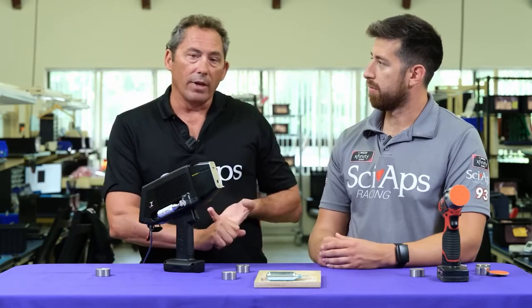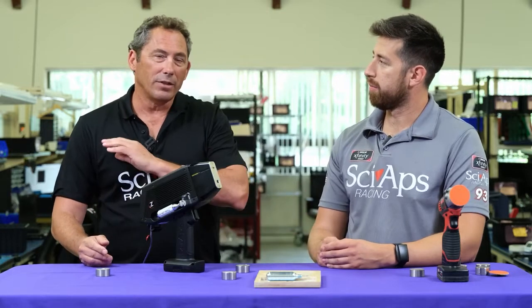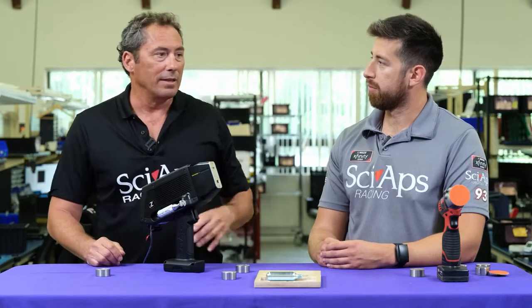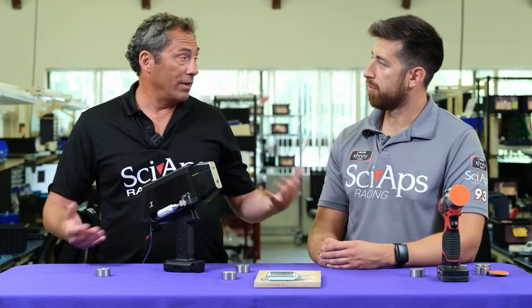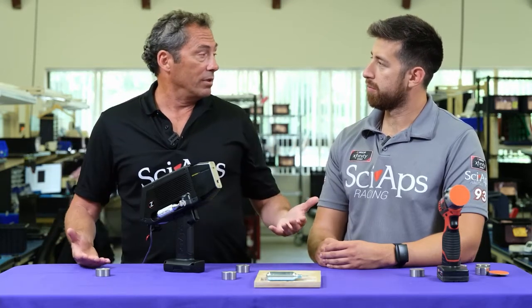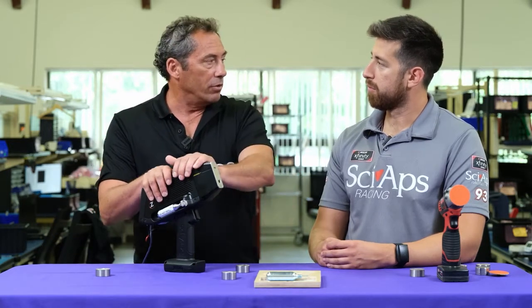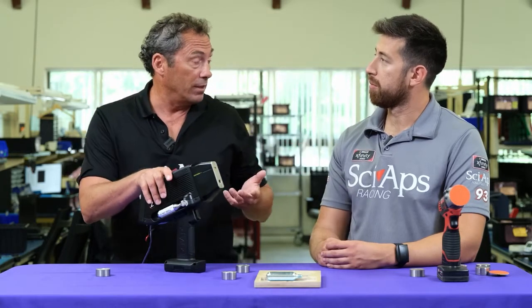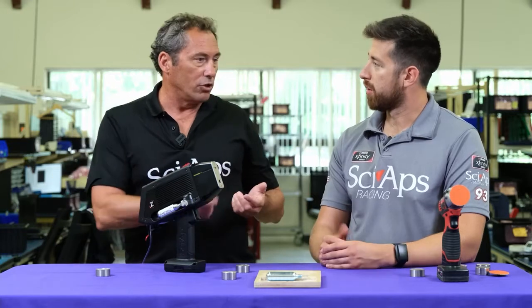The reason we came out with that is because there are a lot of people with X-ray guns out there. X-ray does great on nickel, chromium, manganese, and all those other elements — it's really a great technology. But sometimes they have to do carbon and the X-ray doesn't do carbon. So instead of having to buy a fully loaded unit, save ten or twelve thousand bucks and buy a carbon-only unit, or carbon and silicon. They go out with their X-ray to shoot it, and if they need carbon they take the CSI unit and shoot it for carbon.